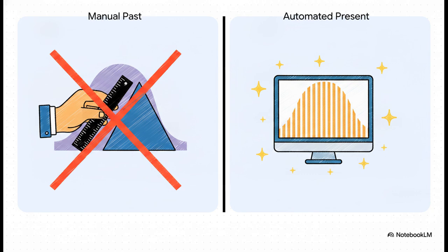Finally, section 5, beyond manual methods. To really appreciate just how good we have it with modern data treatment software, we have to look back at the wildly tedious manual methods of the past. Before recording integrators were everywhere, lab techs actually used a manual triangulation method to measure Gaussian eluting peaks. The formula? You took the width of the peak at half of its height and multiplied it by its total height. They were literally treating a complex chemical signal like a simple triangle drawn on chart paper.